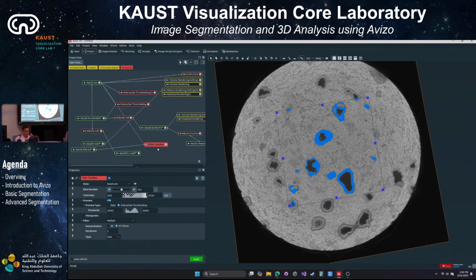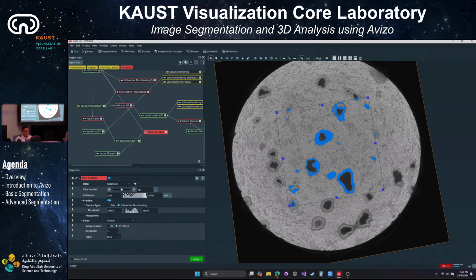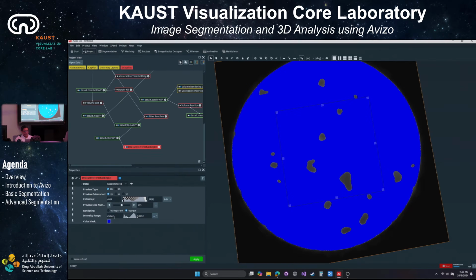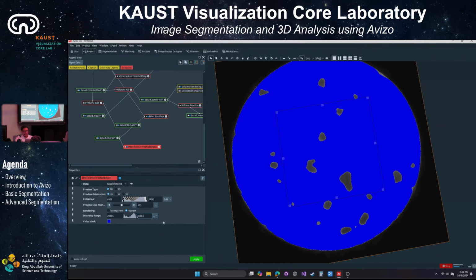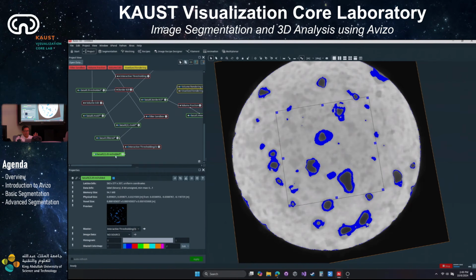Yeah, we're running out of time as well. I click apply, and I apply thresholding here, and I can just copy paste the threshold that I had here. Can be a bit confusing, but again, you can go back to the YouTube video later on to trace back the steps. And now you can see, right, of course we have a different image, it looks different, but that's because I was focusing on the mineral part. And now if I click apply, I should have the mineral segmentation.